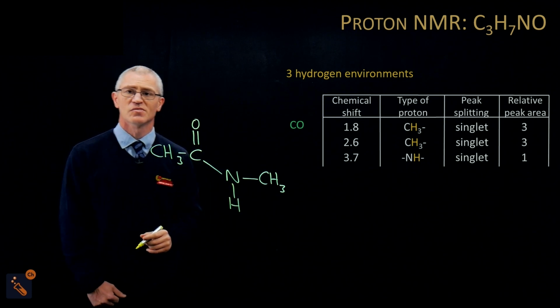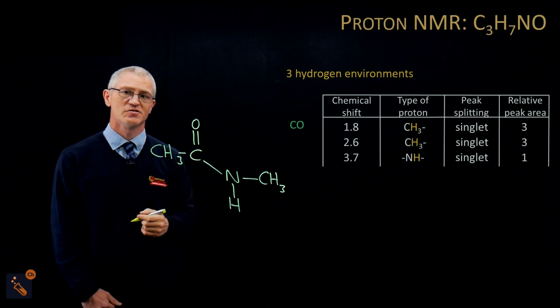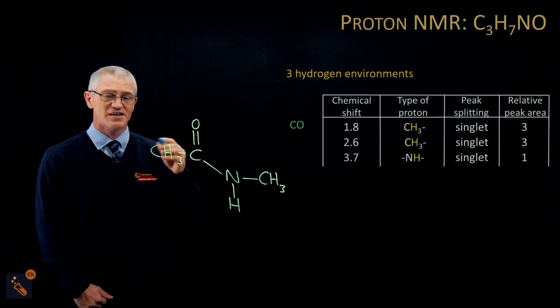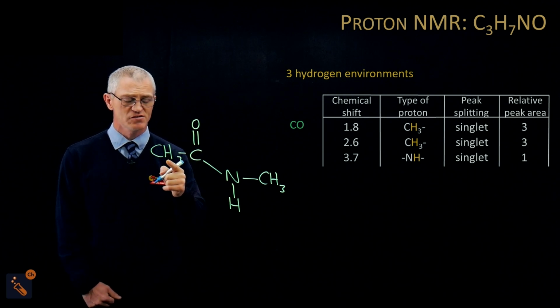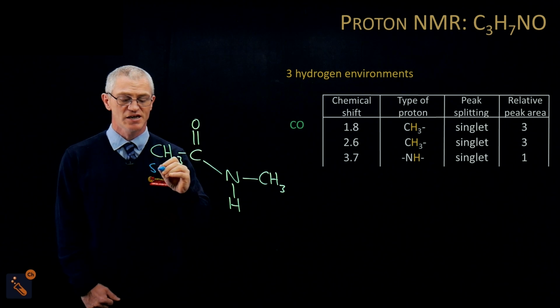Okay, so this looks like N-Methylethanamide. Okay, but let's go through this and see whether it works out. So we have this hydrogen, this proton, next to a carbon, next to that carbon with no protons on, so therefore it will be a singlet.